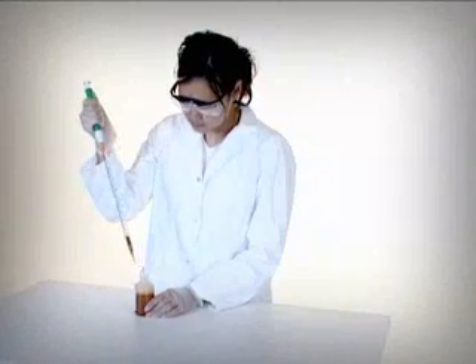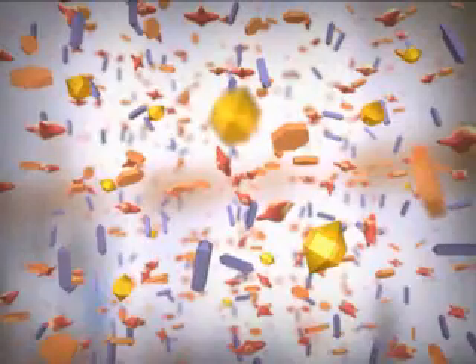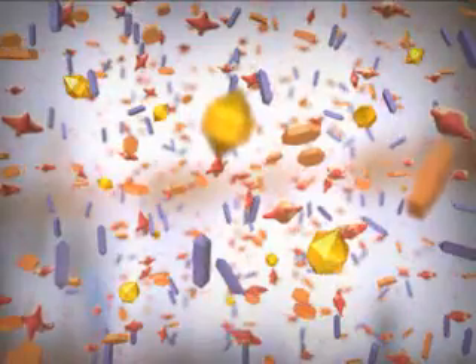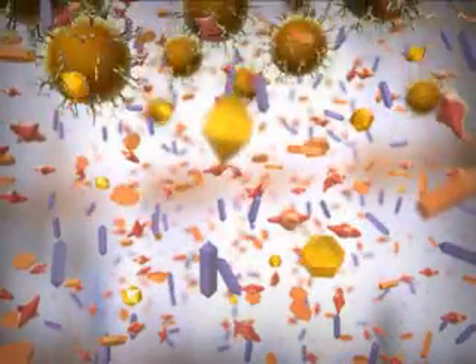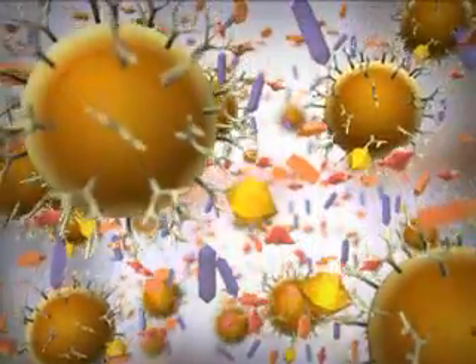Let's look at the isolation of an antigen. Complex samples like these require techniques of extremely high specificity and purity. The use of antibodies attached to magnetic beads easily meets the requirements.